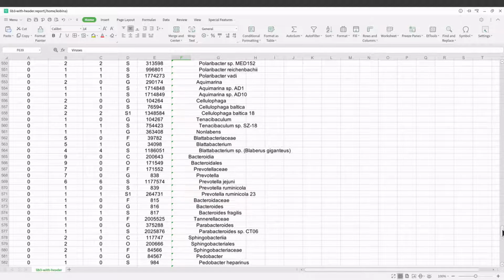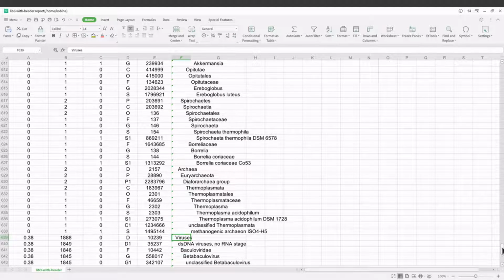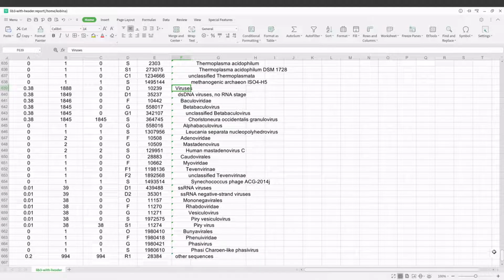And so if you know this, then you can also do some statistics. You can also do visualizations as well to try and get a better understanding of what you have.